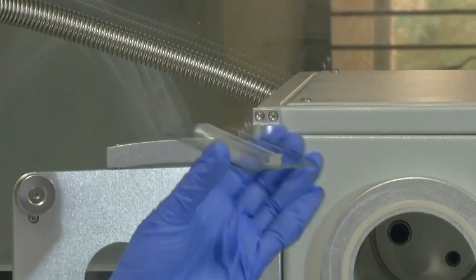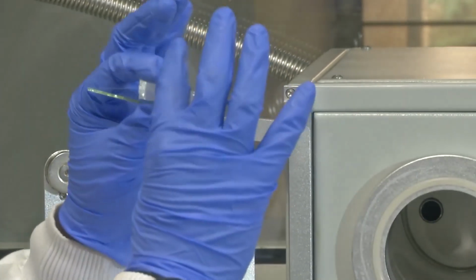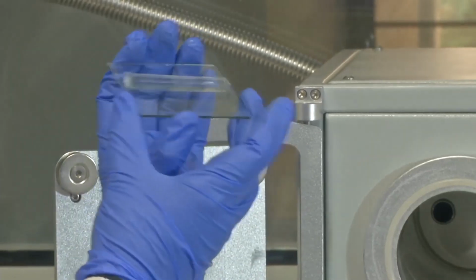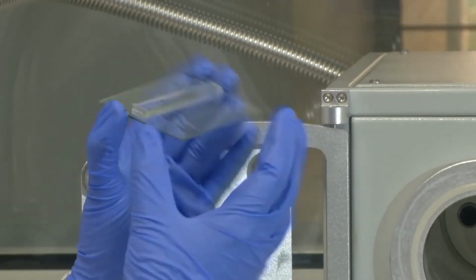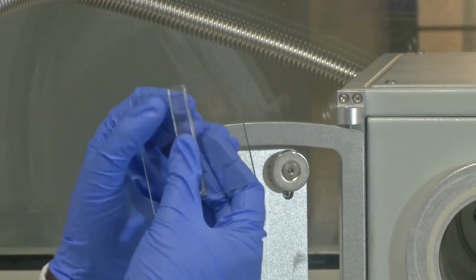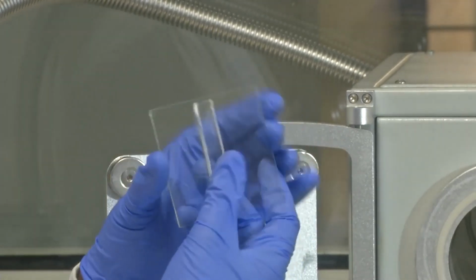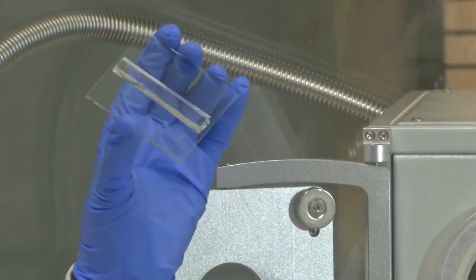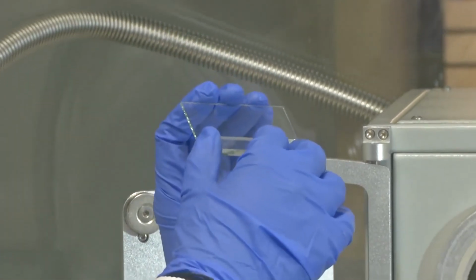Okay, so this way we can make microfluidic channels on this PDMS membrane and bond it with a glass substrate that has sensors, without using any glue. This is the advantage of using plasma bonding. Okay, so we have bonded it nicely.